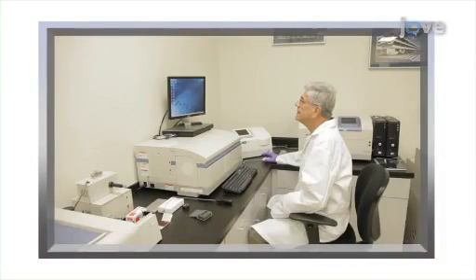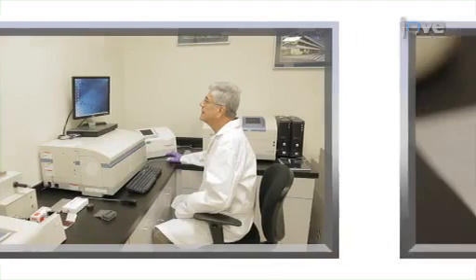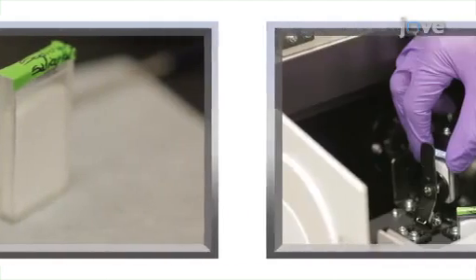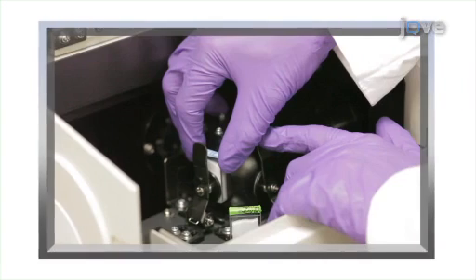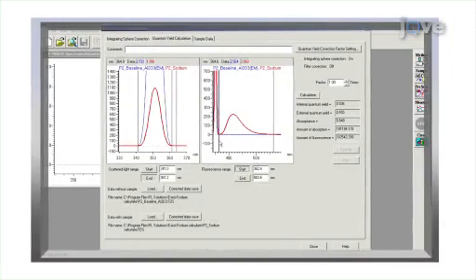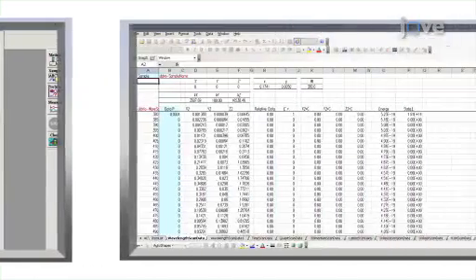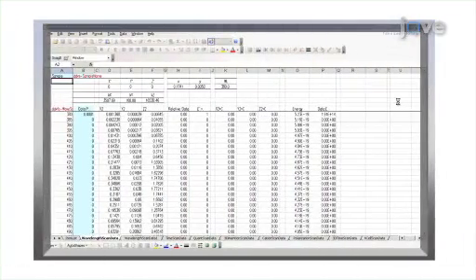The next step is to measure the reference and the sample. Then direct and indirect excitation measurements are used to calculate the corrected quantum yield. Additionally, chromaticity coordinates are calculated using the fluorescence emission data for the sample.